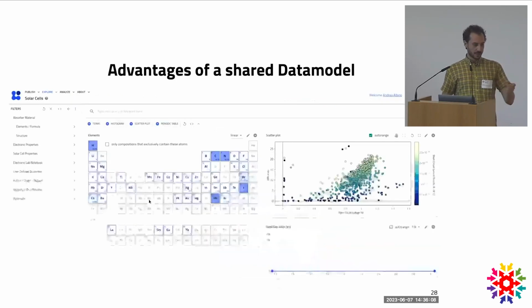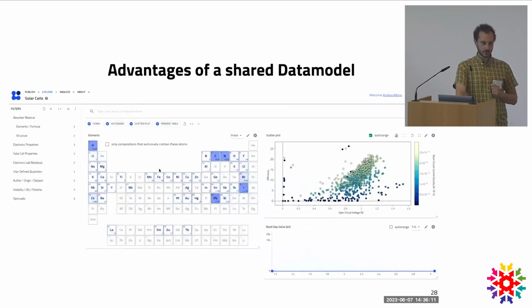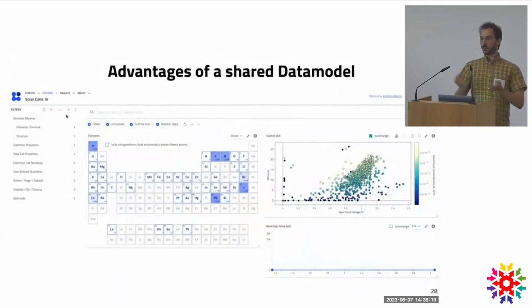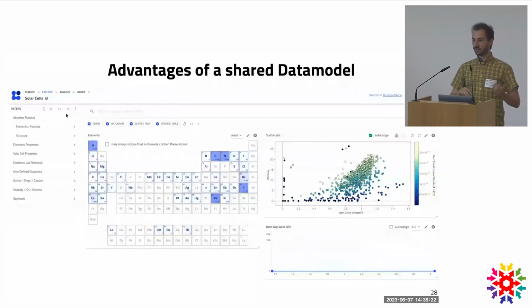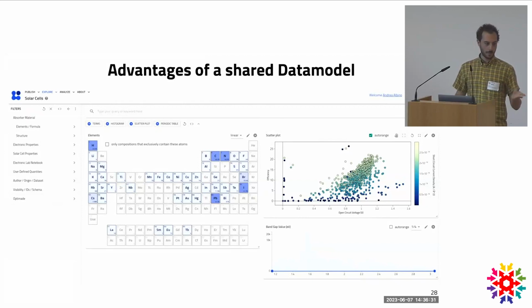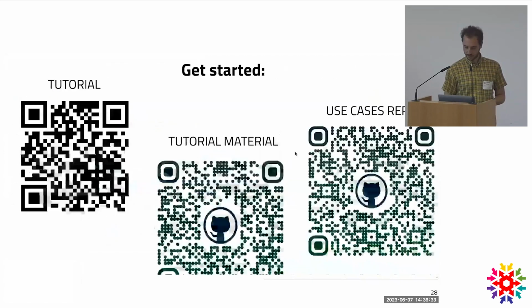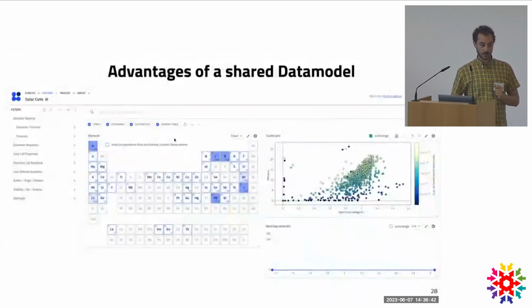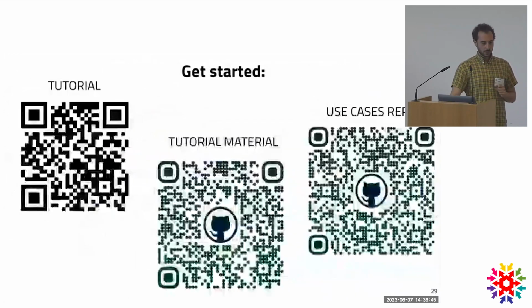And yes, this is another advantage that we can have out of structured data. This is simply showing the solar cell app, which is one of our most complete examples, in which we basically have a very homogenized database, and so some searchability tools could be produced to serve this data. There are specific plots, some scatter plots describing our data, and other kinds of widgets can also be implemented.